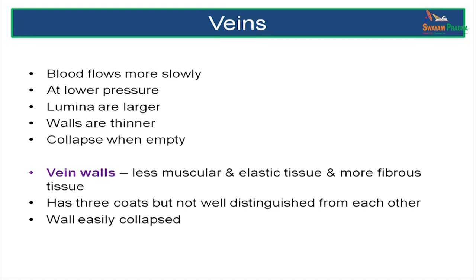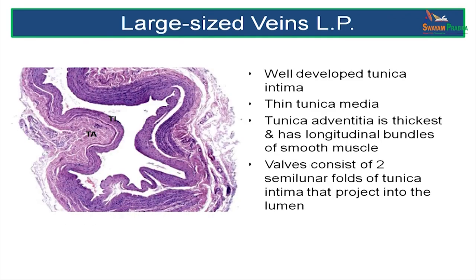Now let us study veins. Veins are larger vessels with thinner walls, having a collapsed lumen and blood at lower pressure. The vein walls have less muscle and more connective tissue. The media of the vein is much thinner than the tunica media of the artery, while the tunica adventitia in a vein wall is more developed. In a large-sized vein, note the collapsed state of its wall. The three layers are a tunica intima, a thin tunica media, and a very thick tunica adventitia, which has longitudinal bundles of smooth muscle.